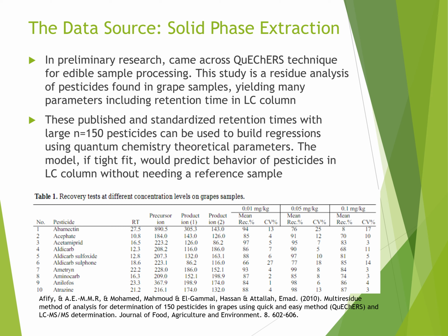The model, if a tight fit, would predict behavior of pesticides in the liquid chromatography column without needing a reference standard. We see here 10 out of the 150 pesticides with their assessed retention times and other parameters. Of note are these retention times highlighted in green.